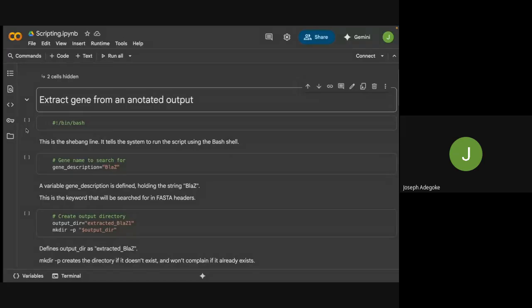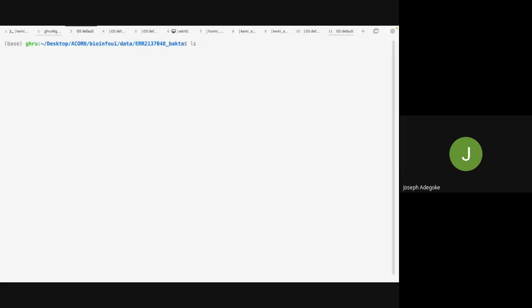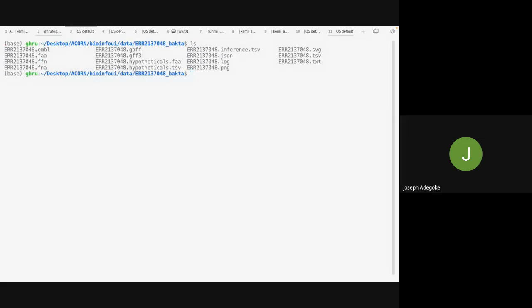Okay, so let's continue. Let me clear my workspace. So what I want to do now is, let me go back.